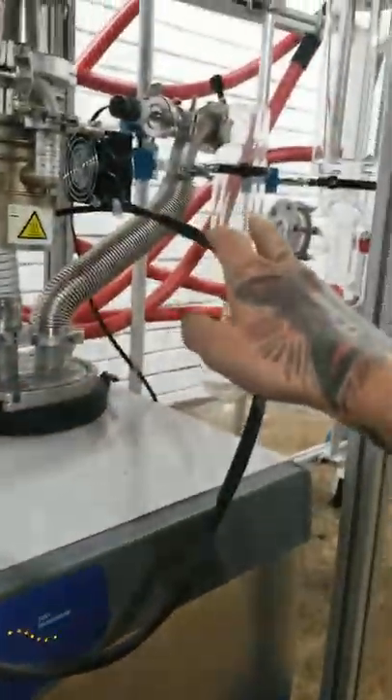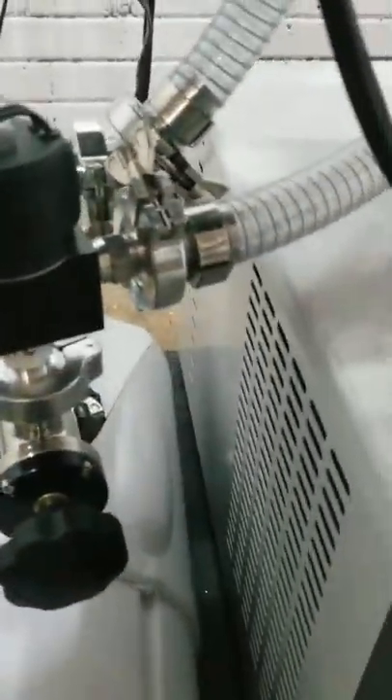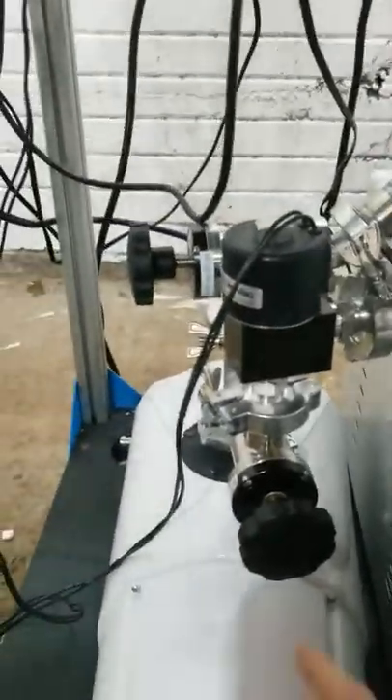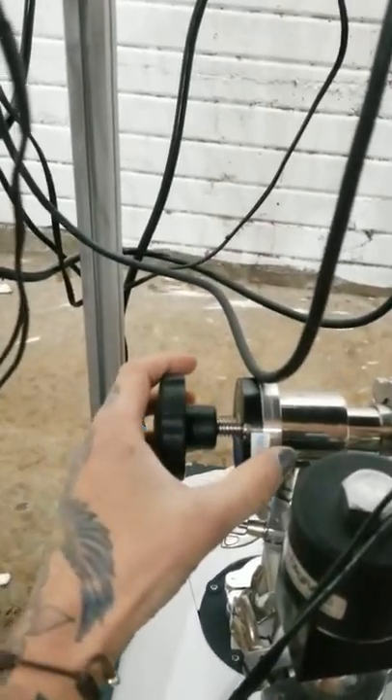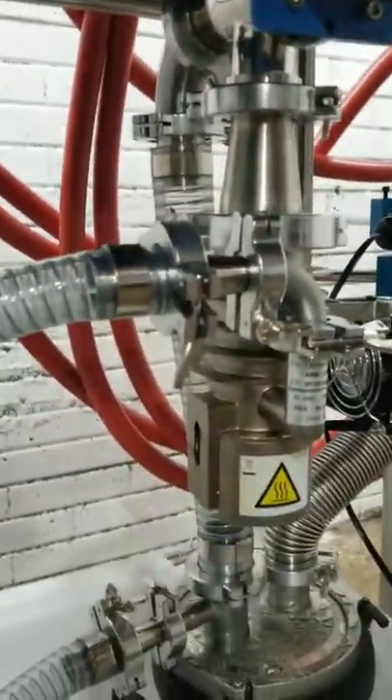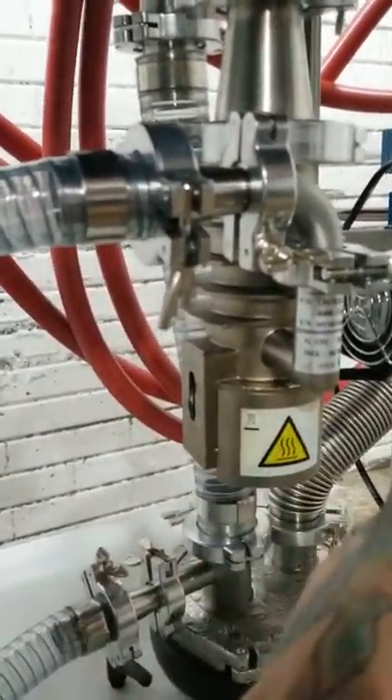The roughing valve leads straight into the cold trap and then straight into the glassware. When this valve is closed and this valve is closed, it'll just be roughing, so the diffusion pump is isolated from the rest of the vacuum. When you're ready to turn on your diffusion pump, you'll close your roughing valve and open your four-line valve here. You're going to keep this valve closed so you're not pulling vacuum, and you're going to heat up your diffusion pump. There's a heater here and a fan here.